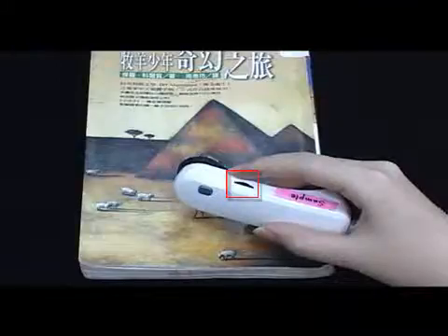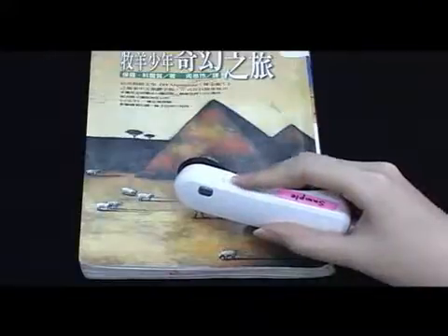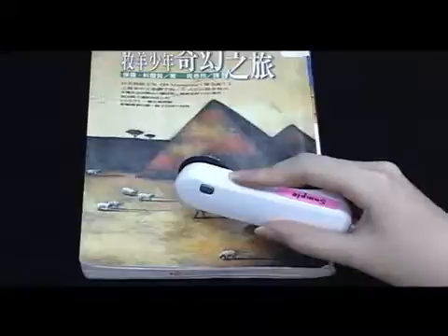Adjust Brightness. LED brightness can be adjusted.